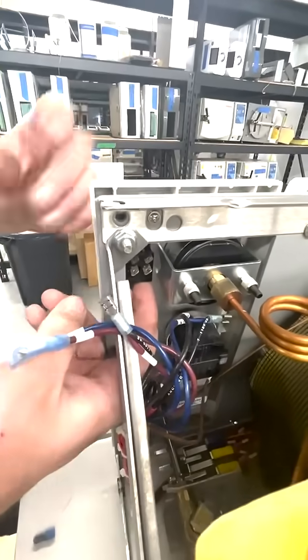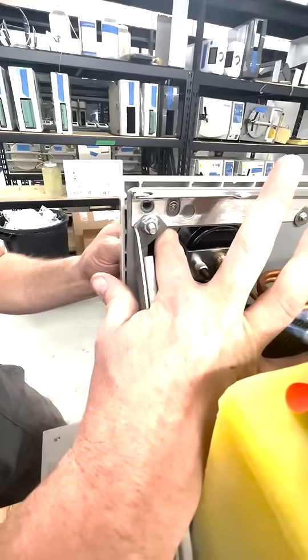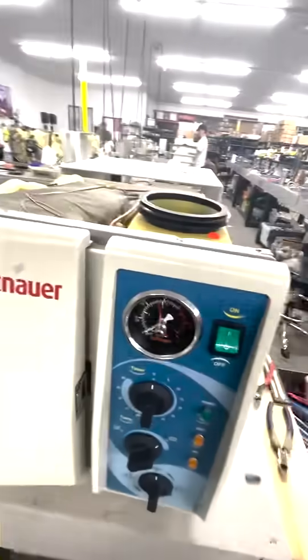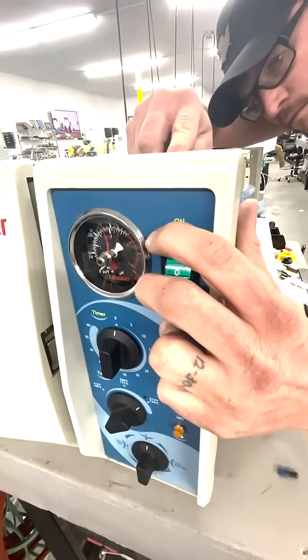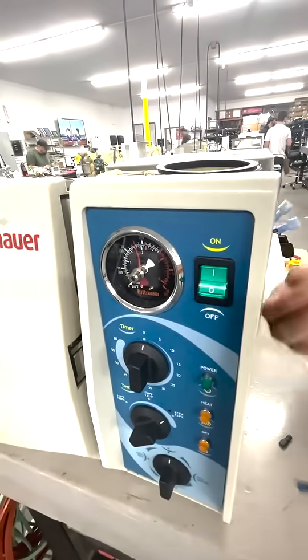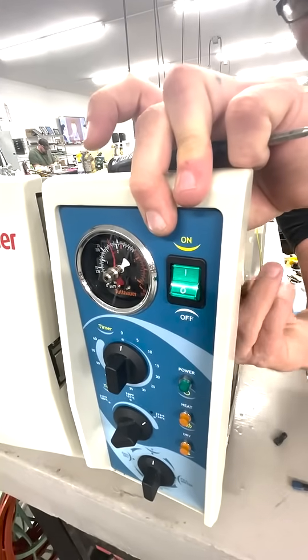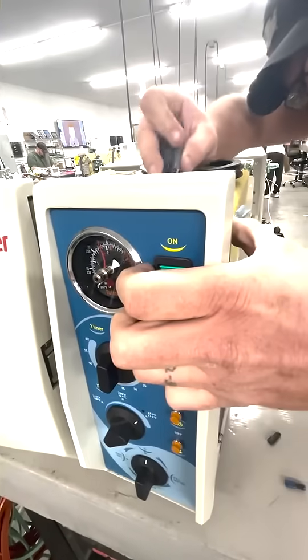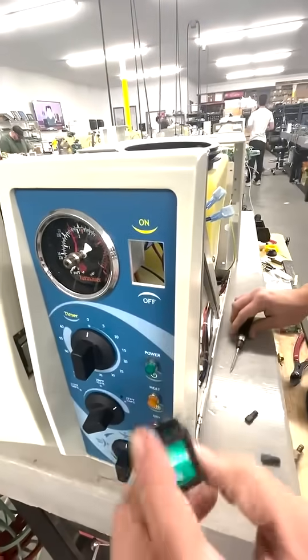This power switch is held in with little tabs on the top and the bottom. I'm just going to press up on those tabs and then down on the bottom ones. Sometimes you need to use something to press on them and push out. And there's our old power switch.